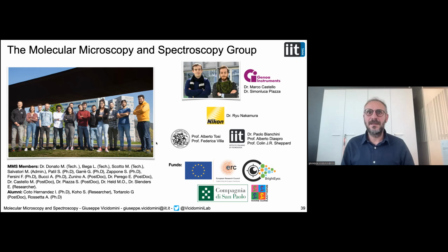Last but not least, that can be combined with two-photon excitation. So if you ask me how deep I can go, I think that's just a question of sample. But I have a lot of different strategies to make this system suitable for deep imaging: two-photon, adaptive optics, optical section enhancement. And I'm sure that all of this will be implemented also by Spark and so on. So this detector opens so many perspectives, giving you access to much information that you can process to match the best imaging for your sample.